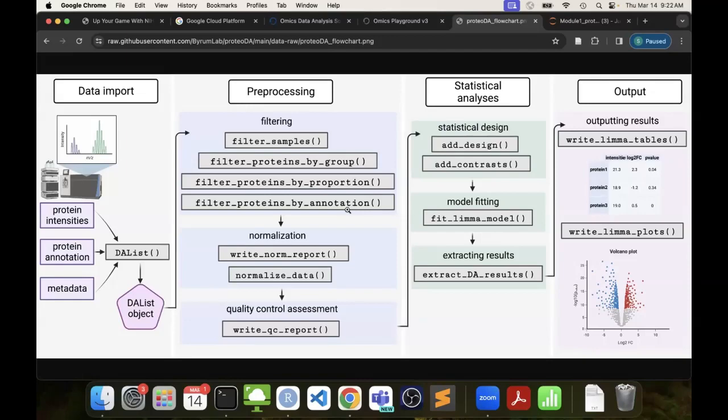So it's an optional step. If you really want to be stringent and you just want your top 50, then you might remove the bottom part of the proteins that has all the missing data. But this is discovery, so I don't like to remove a lot of stuff. If you leave it in, you're going to have those zeros, and you'll see it on the volcano plot where it's way over here, because your fold change is now inflated by missing values.